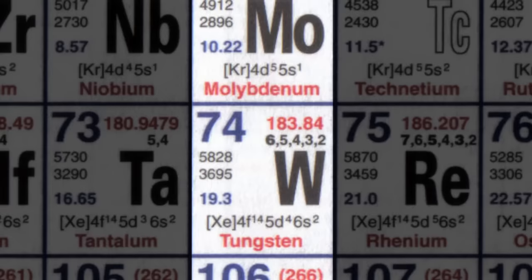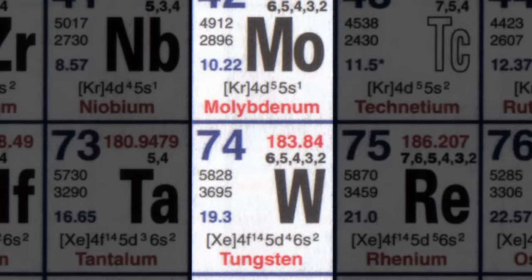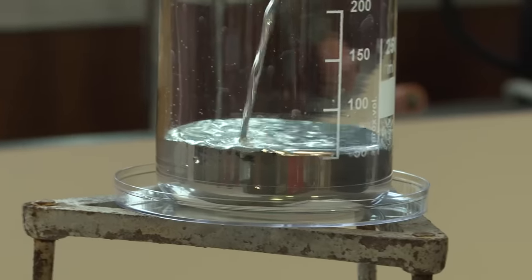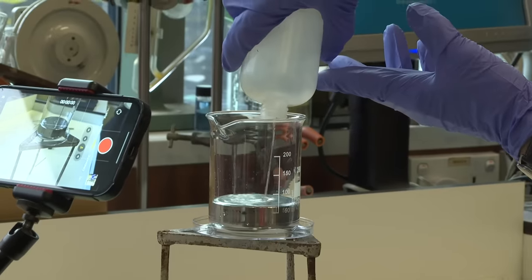I had an idea for a demonstration because I noticed that the density of mercury is lower than the density of tungsten. So, tungsten should sink. But molybdenum, which is above tungsten in the group, should float. So, Neil, after a few attempts, set up mercury in a beaker so that we could film underneath and on top.